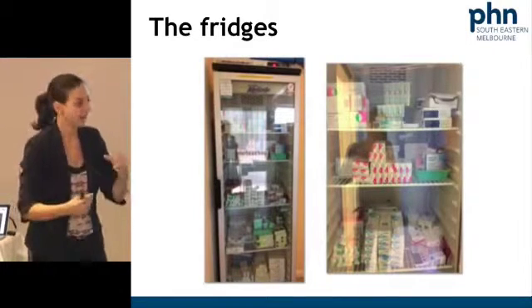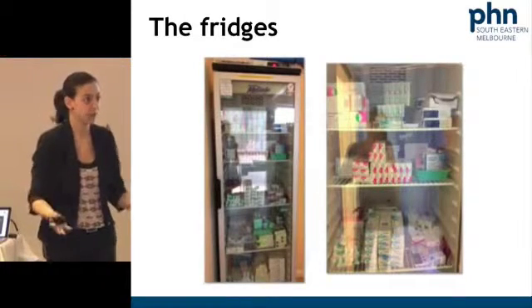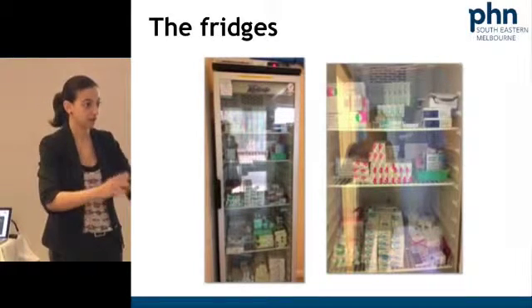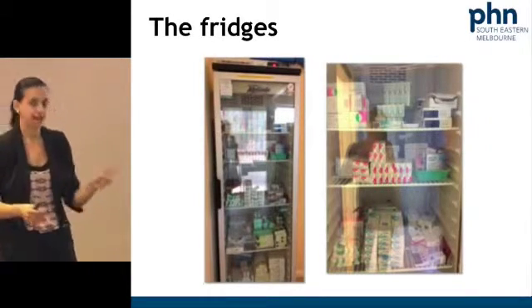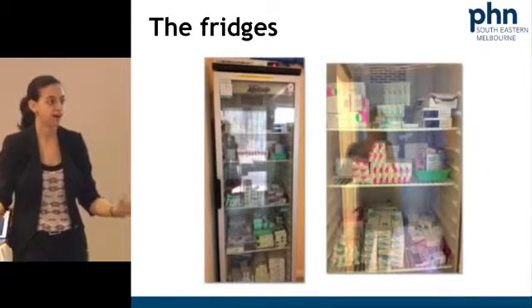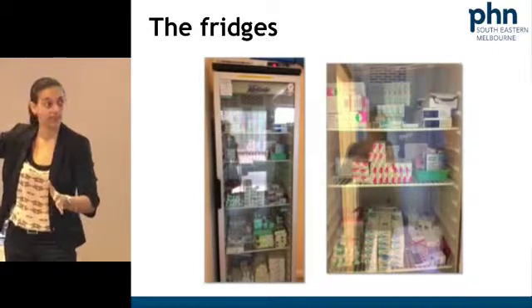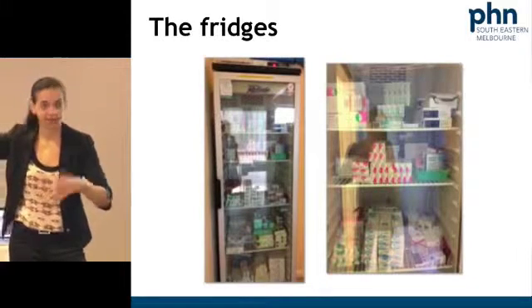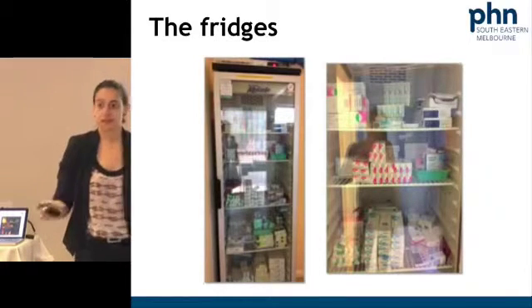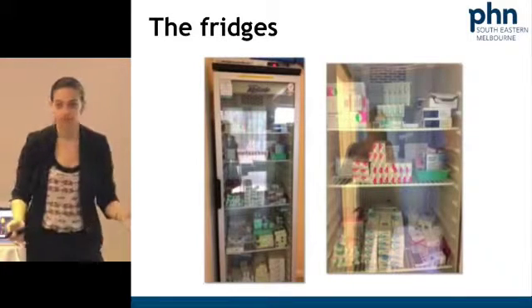Now they called me after they had done all this. They actually called the company and said, how's this possible? The fridge is brand new. And they said, we're going to send one of our own rep maintenance guys. And again, this was a different practice, another second opinion said the fridge is perfectly fine. It's well within less than 1 degree. Same as the second opinion from the other company, less than 1 degree between the shelves, no issue whatsoever. So this is a bit of a warning and watch out. There are potentially scams out there.